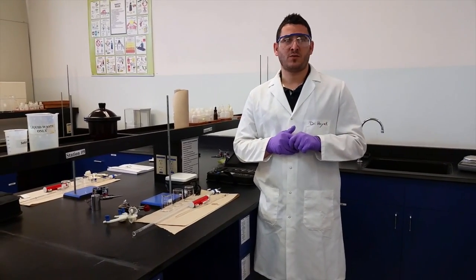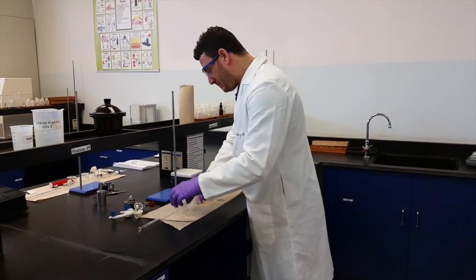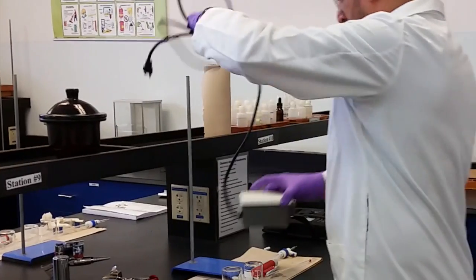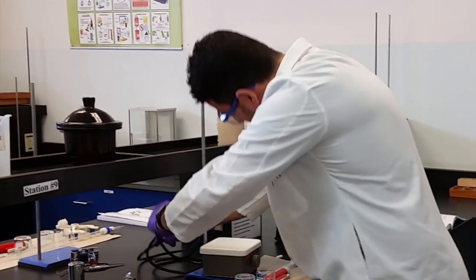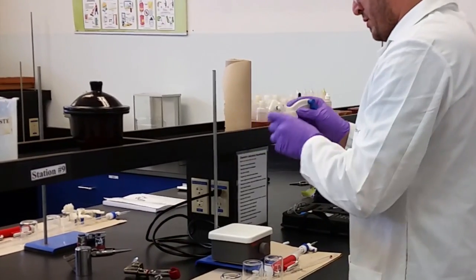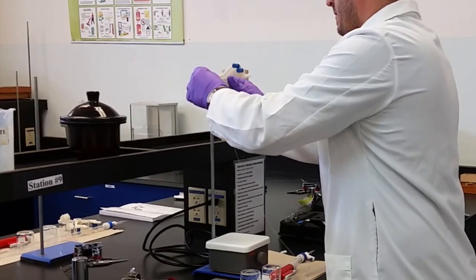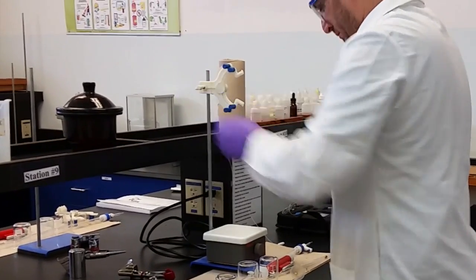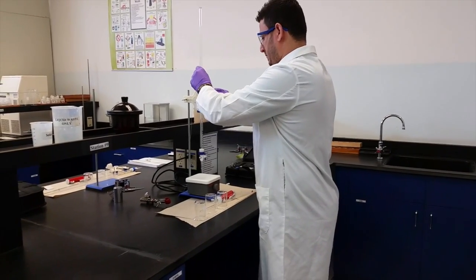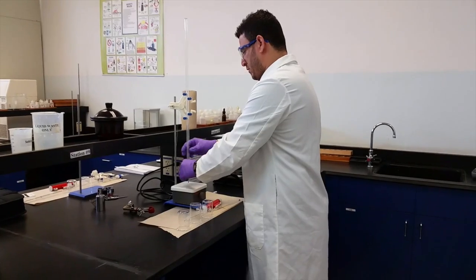And the important part of answering these questions about this titration is to draw your titration curves. Okay? To start this, first you need to set up your experimental setup. So you have the support, the stir, your burette clamp, when you put your burette, make sure it's closed.